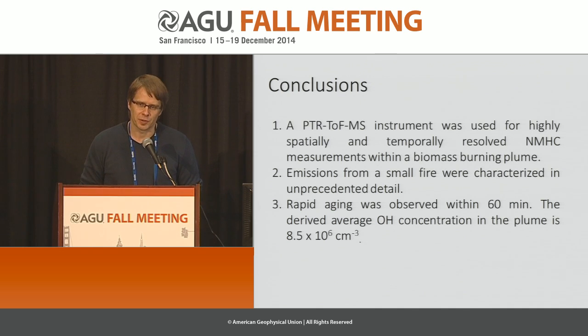So of course, the higher you go, the more difficult it becomes. And then you look at what is available in the literature. Then you look at the time evolution. Then you see if it is a reactive or non-reactive compound. Then you can narrow it down. There have been a number of comparisons in the past with WAS and with TOGA, which are GCs. So we have a good idea, and then we give an assignment or a tentative assignment. Then the question is, what is the error of your formula assignment? Do you have some error to something like that? You mean the mass accuracy? Yeah, we have mass accuracy of around 10 ppm.